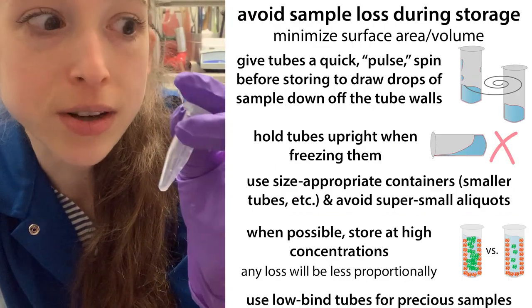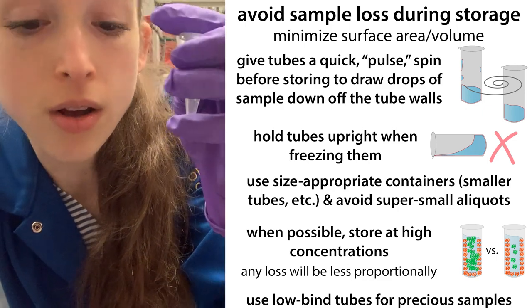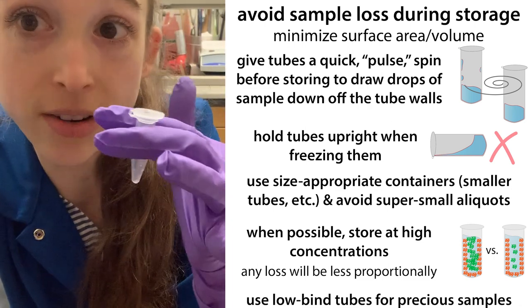So bottom line: you want to avoid losing your sample, so spin it down and hold it straight up. Also, if you have really tiny samples, try to make them in smaller tubes so that there's less surface area.